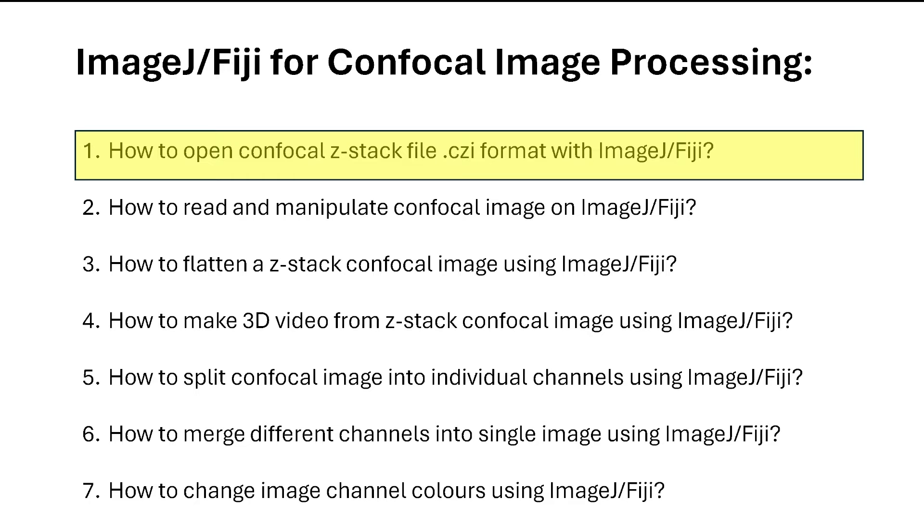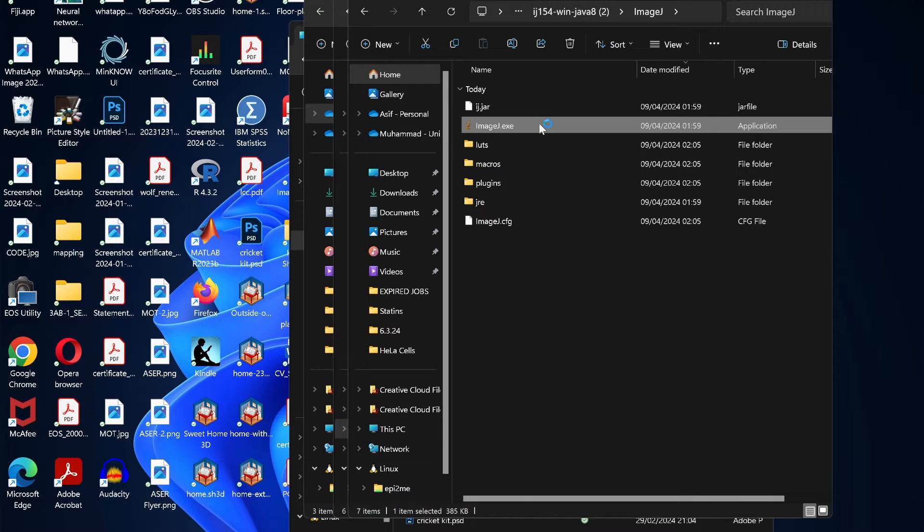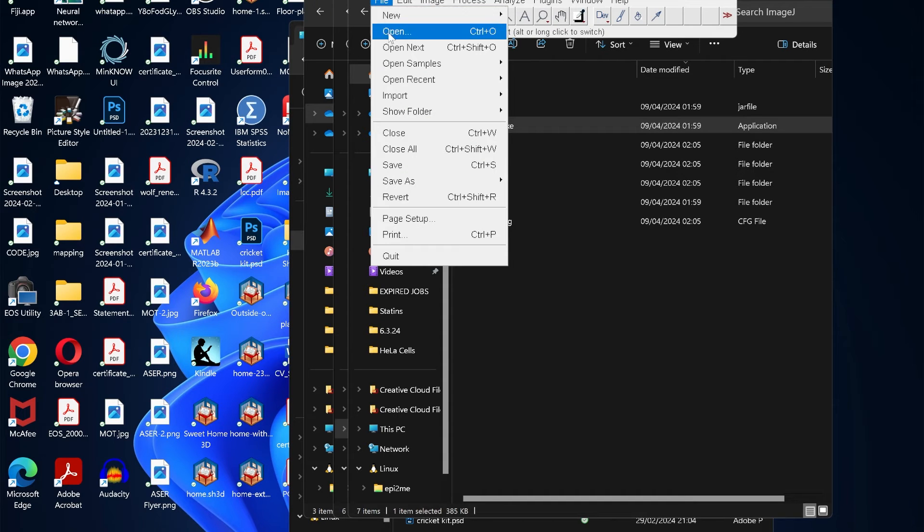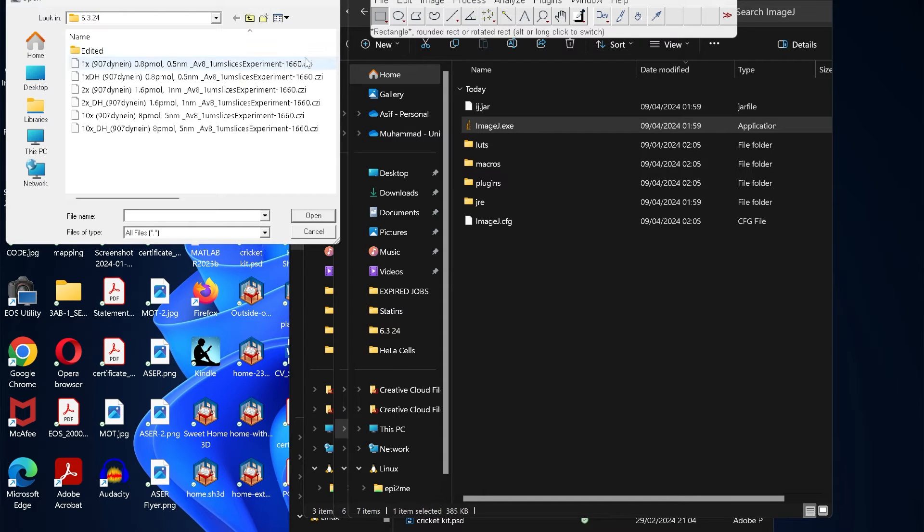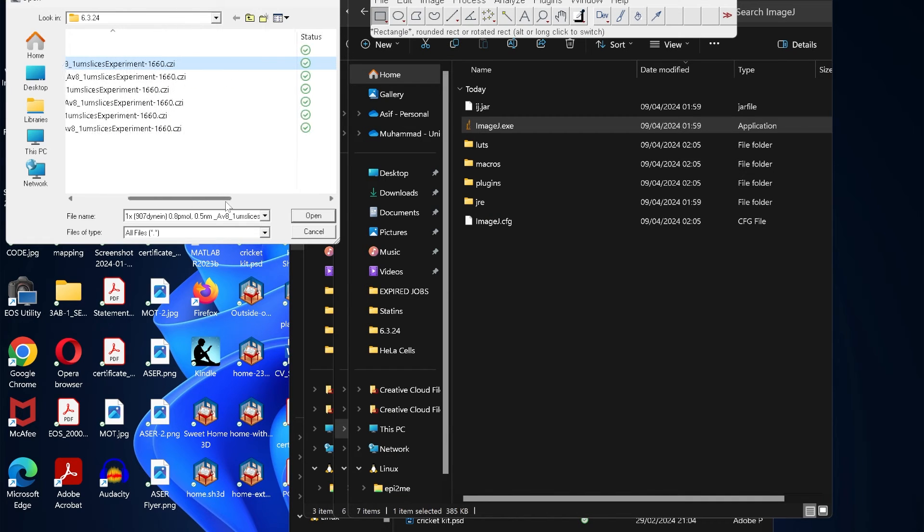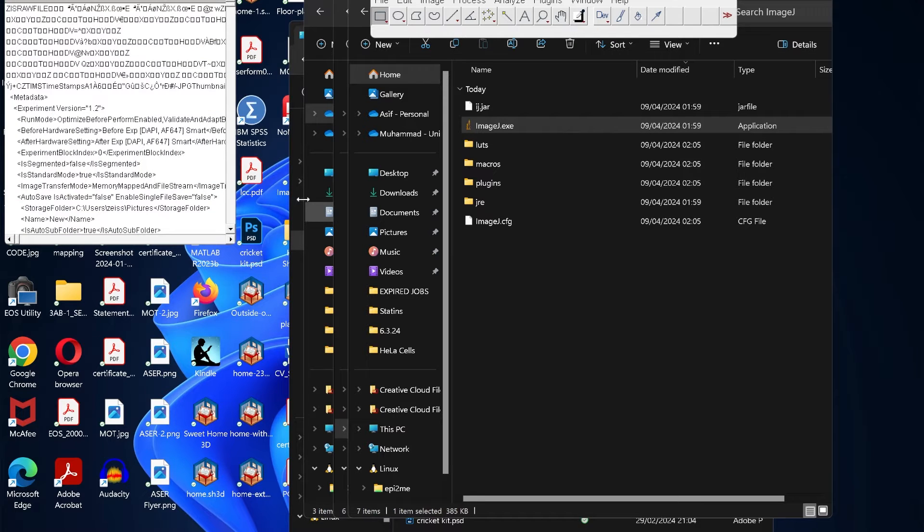Let's see how to open or read a confocal z-stack file with ImageJ or Fiji. If you try to open the image and then go to File > Open, here we have various confocal images in CZI format. If we try to open that, it won't let it open.